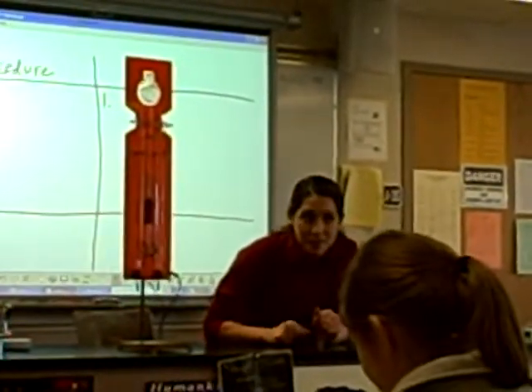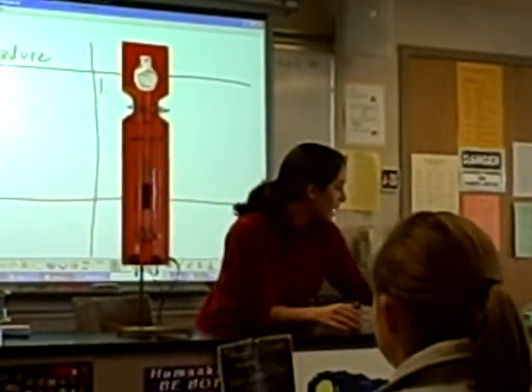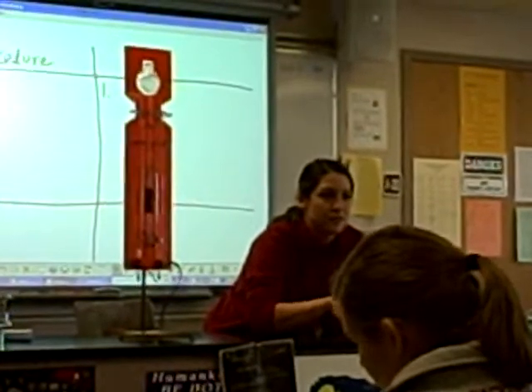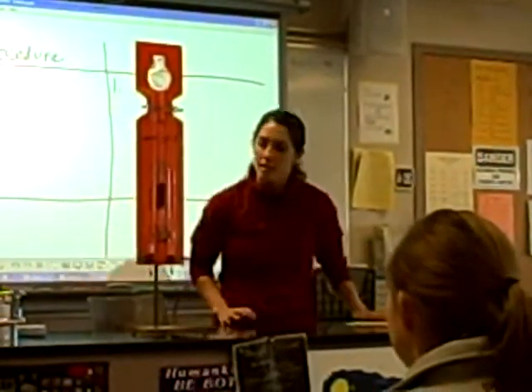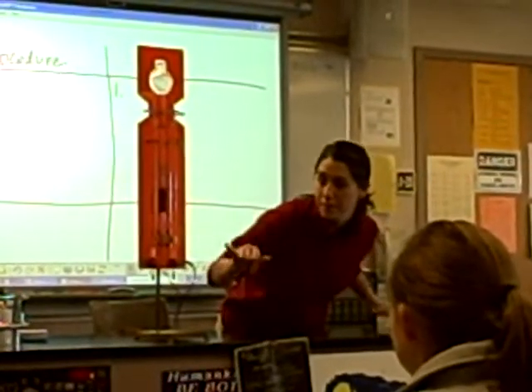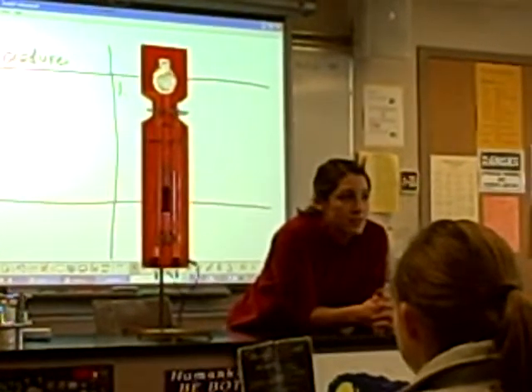So when I flip the switch on, the electricity is going to decompose. The name of the decomposition is electrolysis. Why do you think they call it specifically electrolysis? Because it involves electricity. Okay, so when I turn it on, what do you see? Those of you that are in front. Bubbles. So you see the bubbles happening? That's the decomposing. So what are your products? What state are they going to be in?